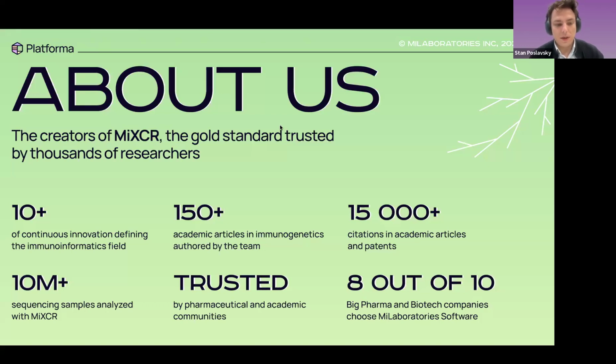Lots of citations, lots of data processed, and actually we put our hands on tons of that data, especially Mark. I noticed some of the attendees of this webinar have already had a lot of communication with Mark regarding various support questions, how to run their BCR analysis on this protocol or that protocol, et cetera. Just one number: over the past 7 years, more than 10 million samples were processed with MiXCR.